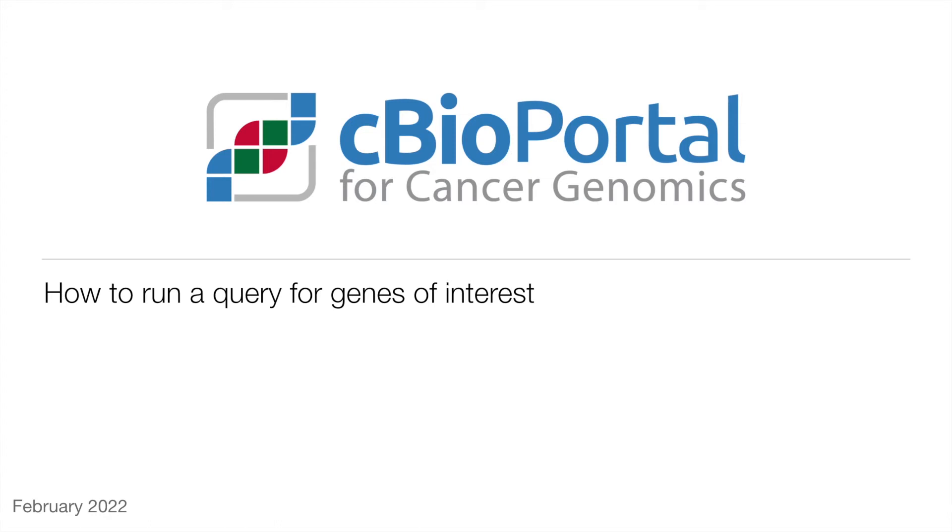Welcome to this how-to video from cBioPortal. In this video, I'm going to show you one of the ways you can get started using cBioPortal, which is querying for specific genes in a study.